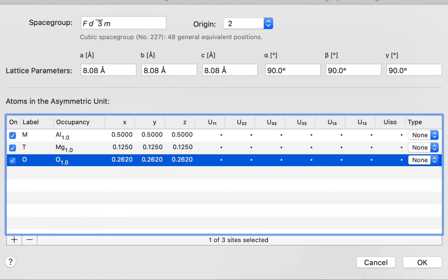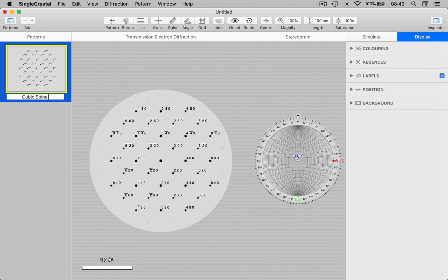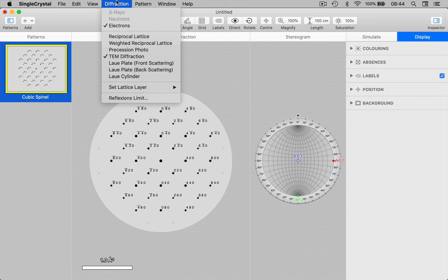Let's go ahead and generate the crystal and its diffraction pattern by clicking the OK button in the bottom right-hand corner. Here we have a simulated diffraction pattern for the crystal we've just entered, and you can see a thumbnail in the patterns list. I'm going to give this a name — cubic spinel. The default simulation type is transmission electron diffraction, so we're effectively looking at a section through the reciprocal lattice. You can use the Diffraction menu to choose different types of simulation if required.